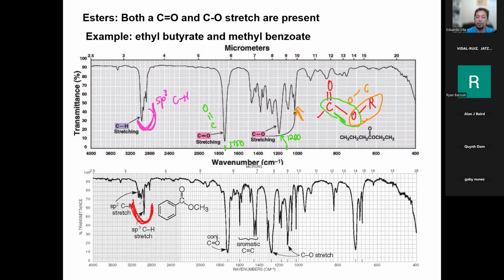Notice the intensity. These are weak. The one on top is stronger, right? The intensity is weaker here because double bonds are stiffer, so it takes more energy to vibrate them. So they're not as intensely vibrating. It's aromatic, so look at this very sharp peak right there at around 3000. This one is right here. This is your carbon-hydrogen aromatic vibration. Make sense? Very unique. Notice the little hills, well, actually, they kind of get obscured. You can't really see them that well.